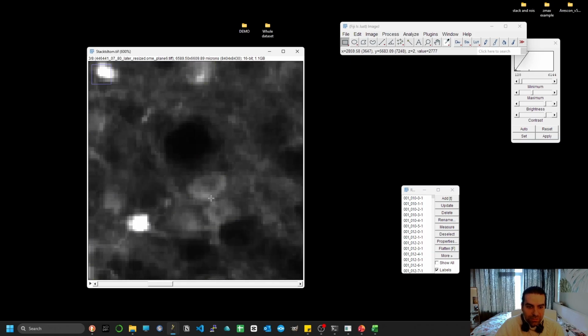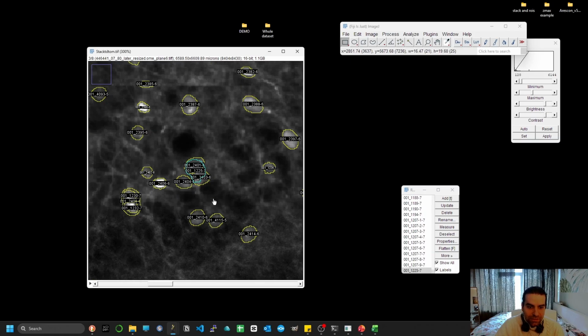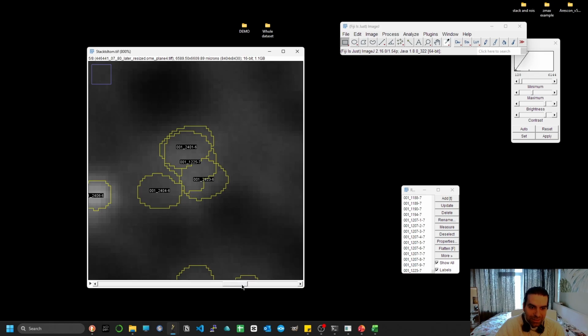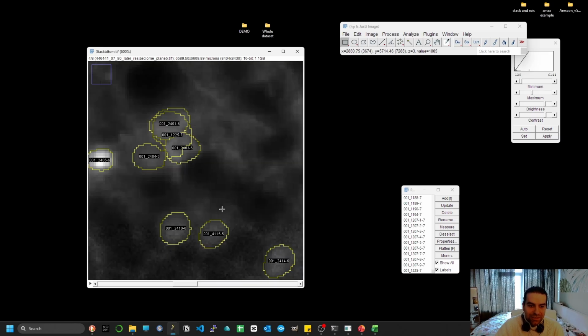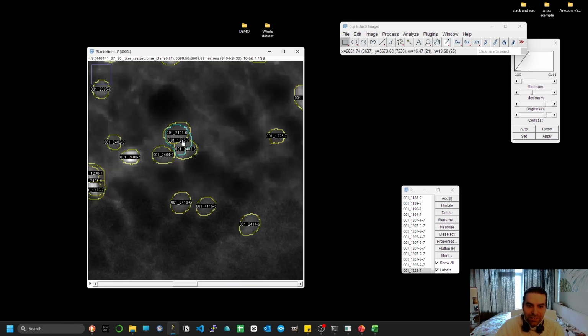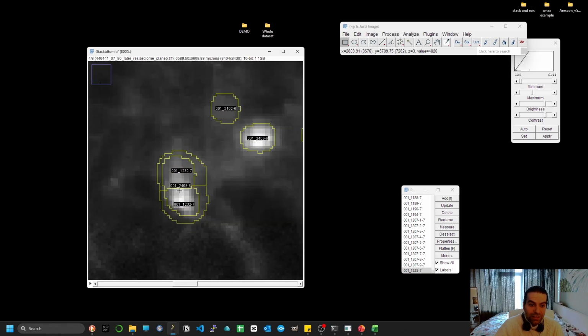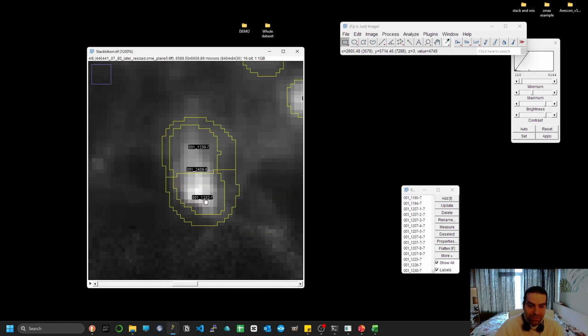Here there might be a mistake. There seems to be an engulfer, as I call this, which is actually one too many overlaps, and this particular one should be out. What you see here is the echo of the other two images, more likely. So the signal just spreads when you move across many planes, and this is the reason it happens. But for that, again, we could go back to the filtering of the default and change it if it's many occasions like that. Here we have another occasion like this, right?